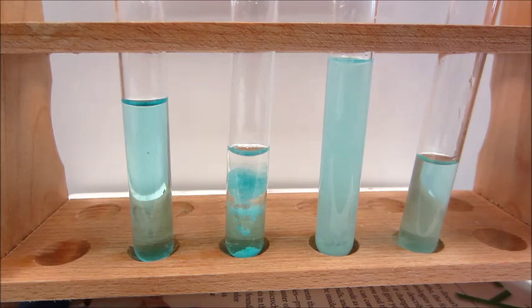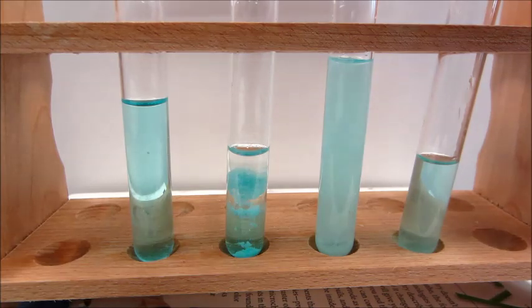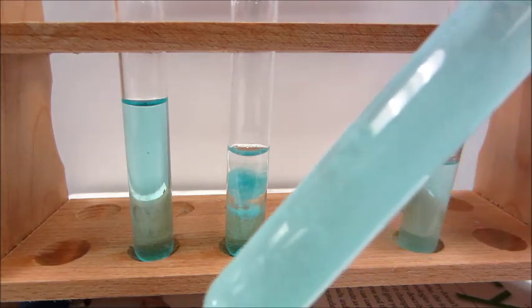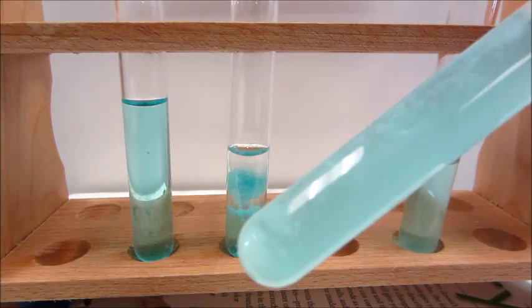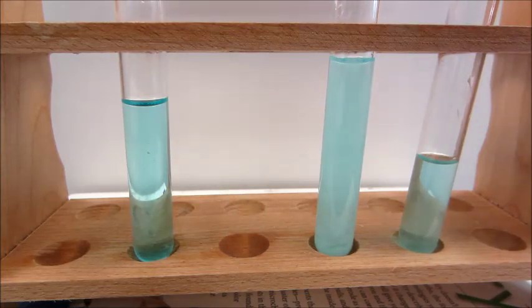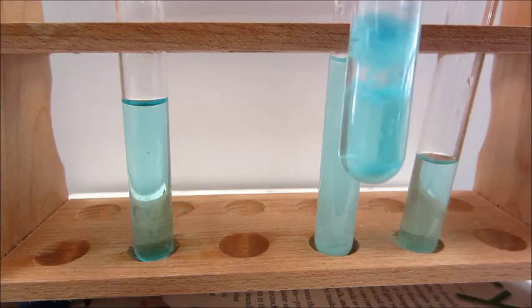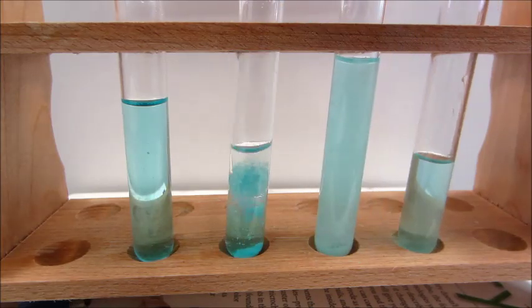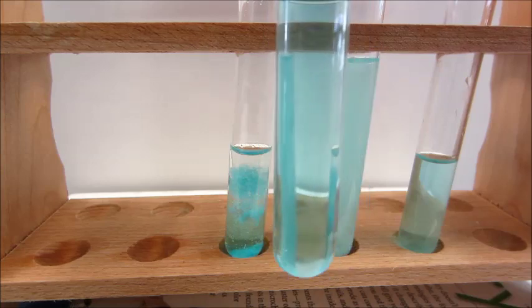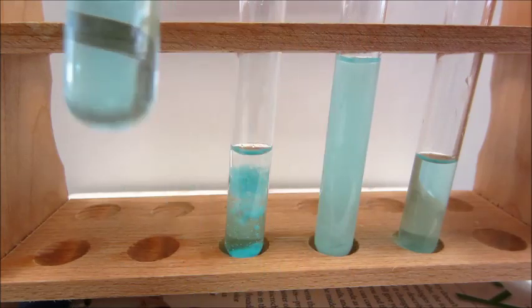Looking back at our copper sulfate samples, we can see pretty clearly now that a reaction has occurred with the calcium chloride — we're seeing precipitate form and start to fall to the bottom. We already saw the reaction with sodium hydroxide, and we can see it more clearly now. We still can't see the reaction with hydrochloric acid; we'll have to use some sort of indicator to figure that out.